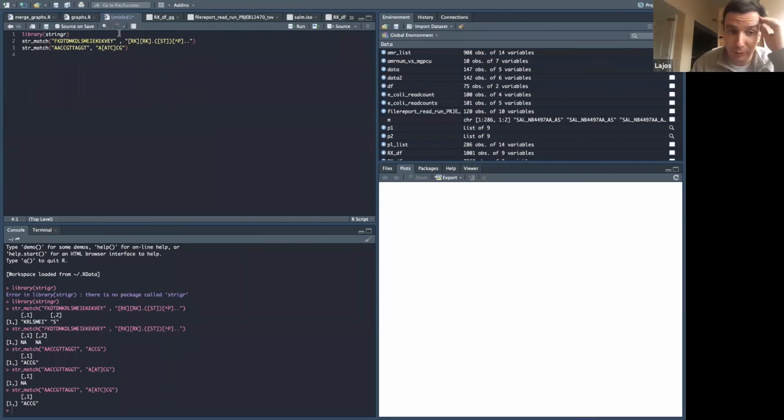For example, we did it with Ibrahim when we were looking for specific known mutations within a gene. So if you look for known mutations and you know the surroundings, and you, for example, PCR sequence the gene or somehow extracted the gene sequence, then you just simply put your mutation site in the middle and you define the two flanks.